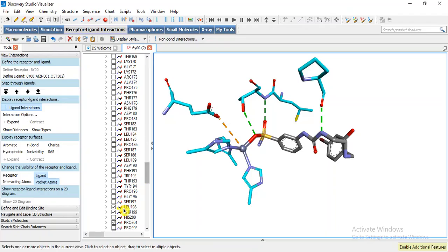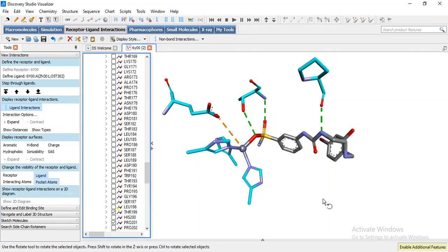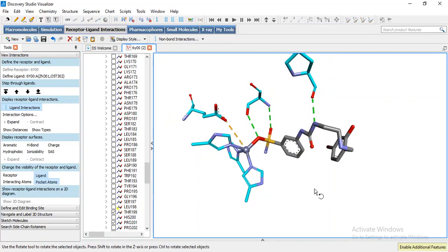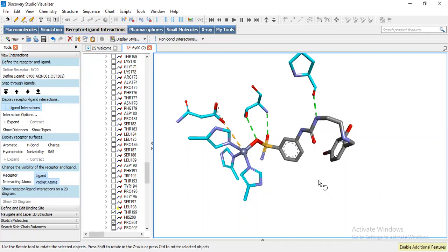This is our residue threonine 199 and threonine 198 is not here so it has no interaction. Now these are our residues which are going to interact.